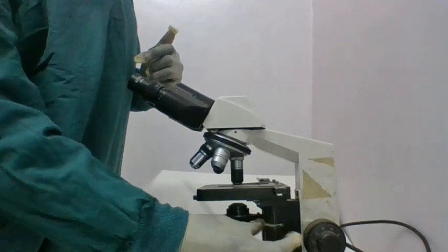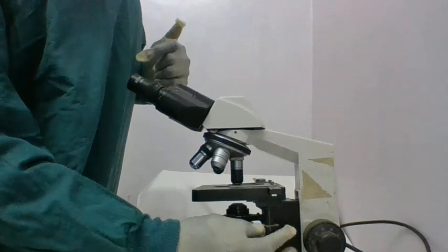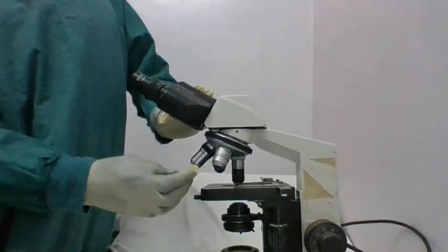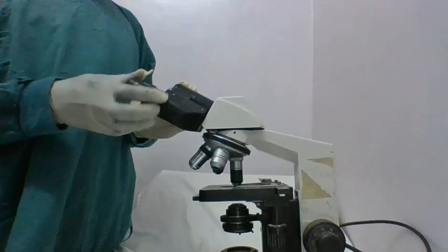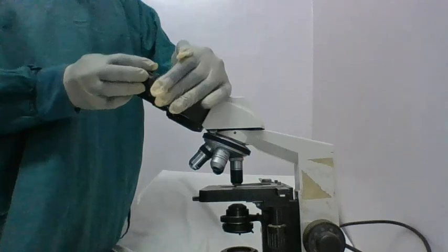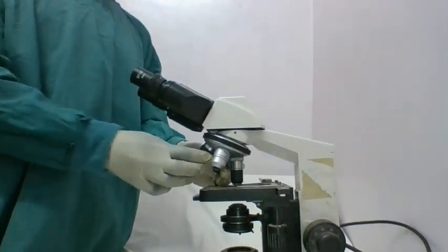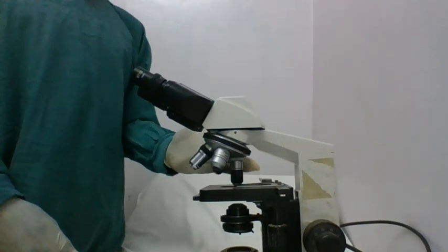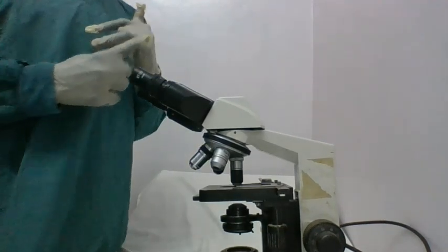The field of examination, what is it known as? Can you remind me in the comment section, guys? So this is the field. These are the adjusting knobs, and these are the different resolutions. When you're examining a specimen, you want to find the fine resolution or the coarse resolution, guys. So we have the fine and the coarse adjustment knobs of the microscope. You need to have the stage where you're going to place your specimen. This is the stage of the microscope, where we place the specimen for examination, guys.